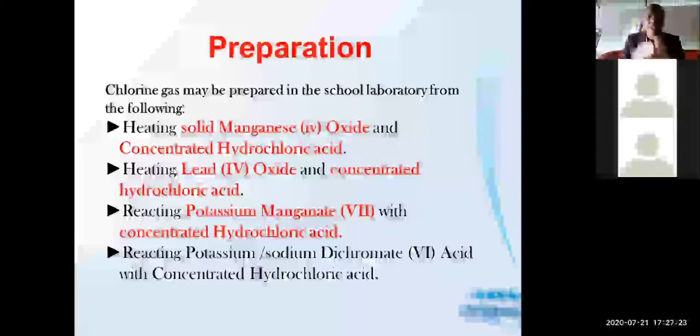Another one is heating the lead 4 oxide plus the concentrated hydrochloric acid. Lead oxide, I think you have learned about this thing called amphoteric oxide. Lead oxide is an example of amphoteric oxide. So I'll be able to explain that as we proceed.